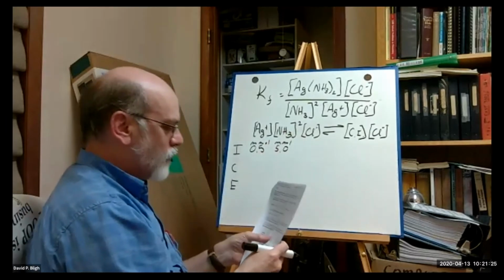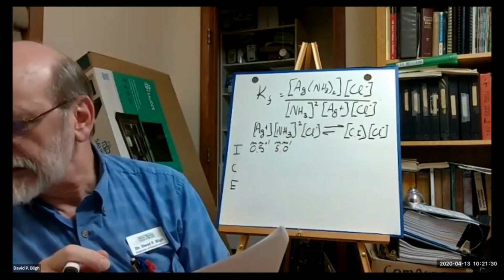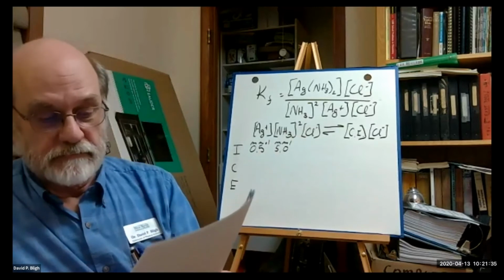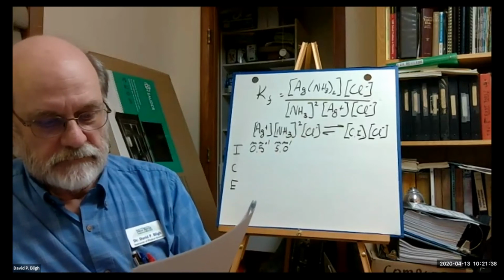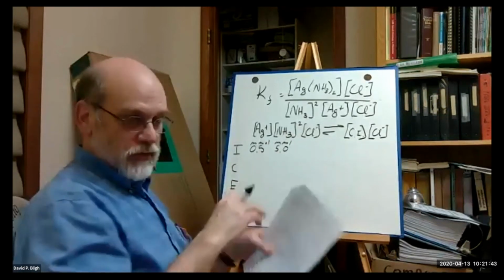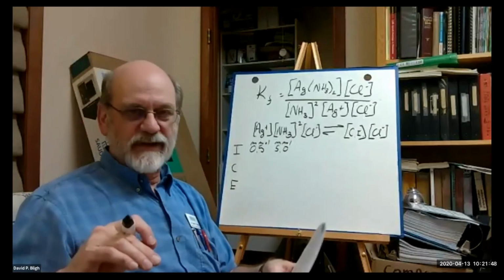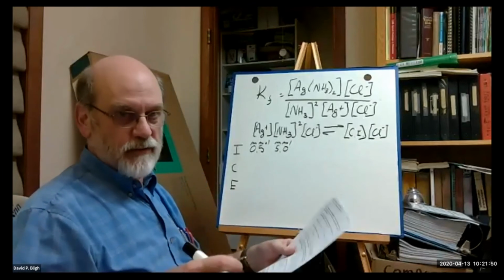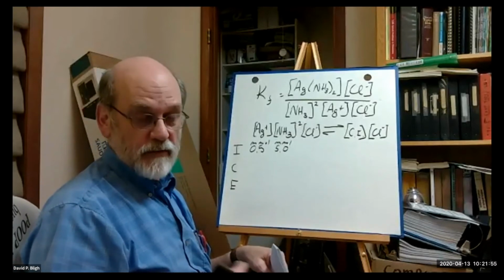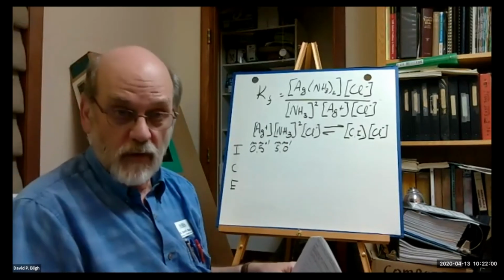We started off with, let's see, well, the chloride that we added initially during the titration would be a value that you're given here. But let's just say, for argument's sake, and keep the numbers simple to deal with, we added 1 milliliter of potassium chloride, and the concentration of potassium chloride is 0.1 molar, right?